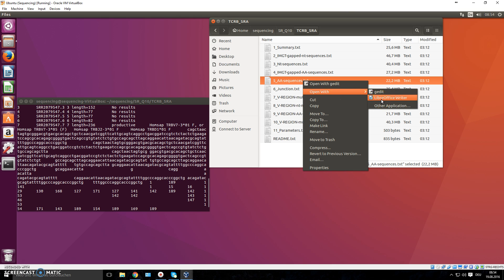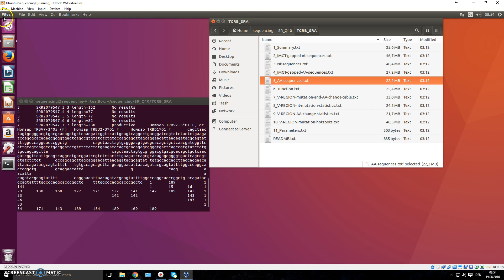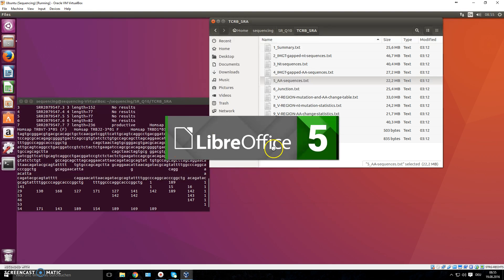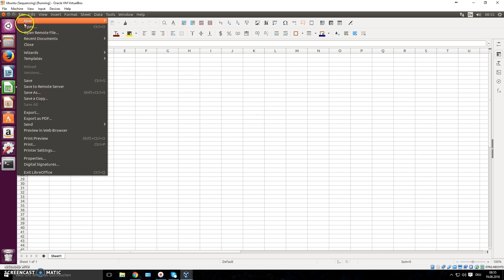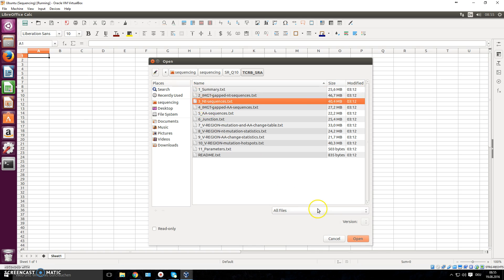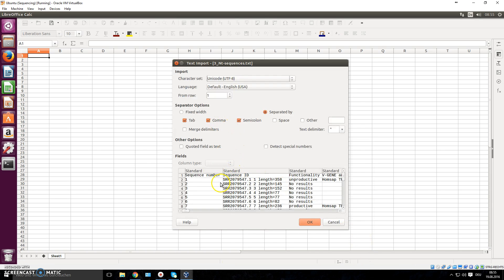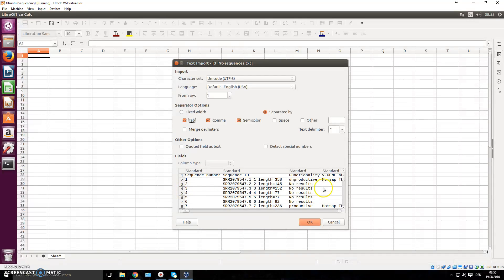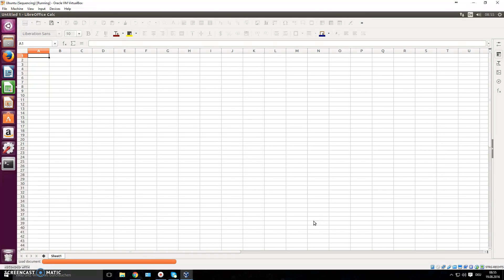If you want to look inside it, you can open it with something like Excel. In Linux we don't have Excel, but we have the open-source equivalent LibreOffice. We want LibreOffice Calc — not LibreOffice Writer, which is like Word. Go to File > Open, move to that sequencing folder and open the file. It will ask what characters to use to separate the columns — in this case it's tab-separated, so select tab and press OK.